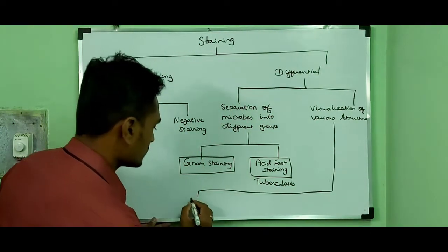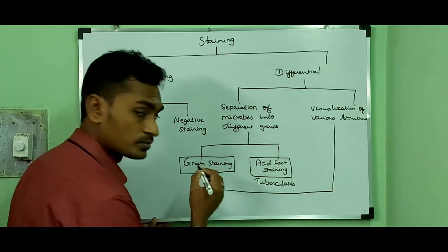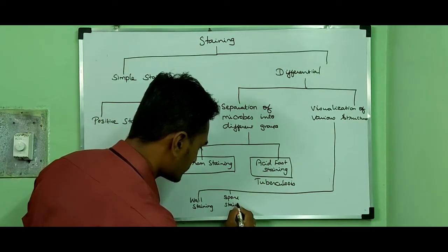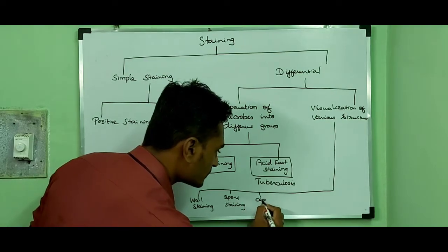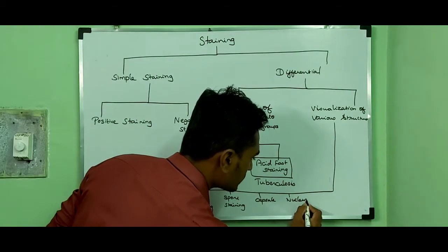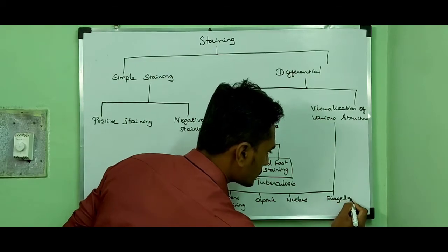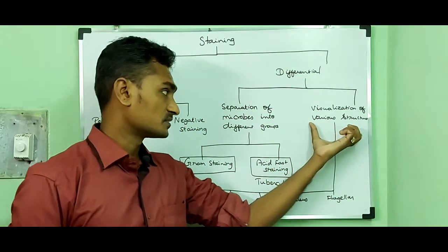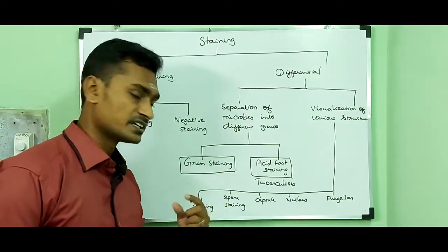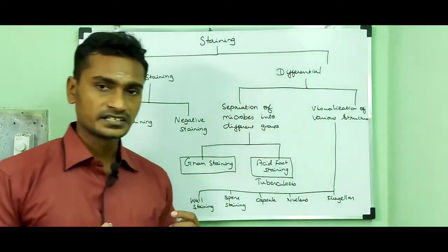They are wall staining procedure, spore staining procedure, capsule staining procedure, nucleus staining procedure, then finally the flagellar staining procedure.